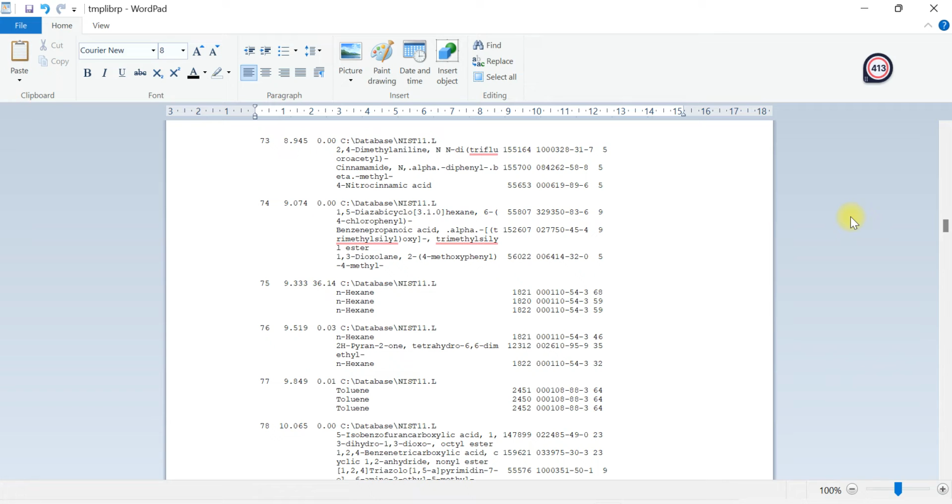That's why you can do purification like the doctor did during her PhD. Purify, and then run for its activity. If not, we run against the GC. If it is not eluted at 9 point something, you can remove that unknown even though it is big. That's why we call it bioassay guided.